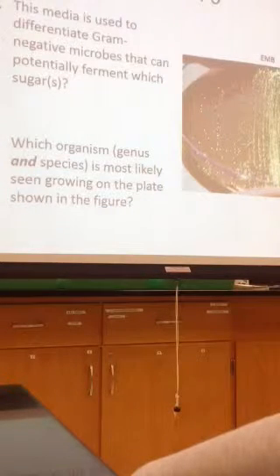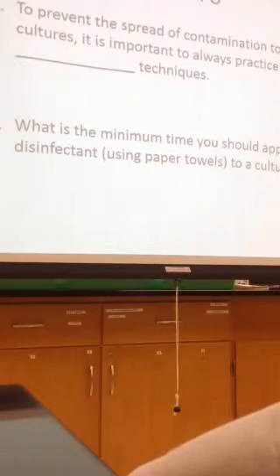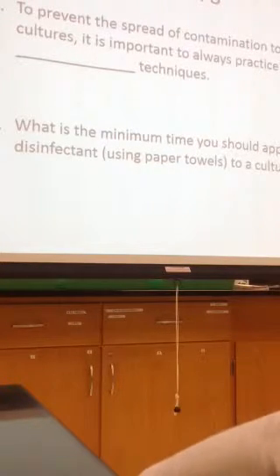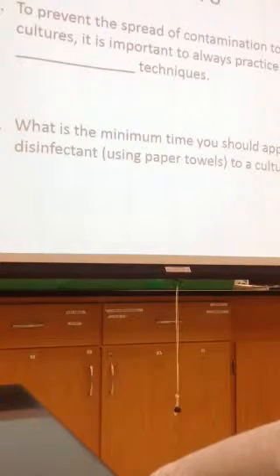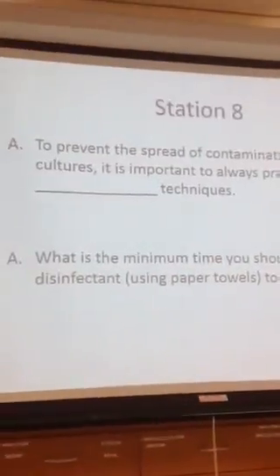You guys don't have to worry about E and B. We haven't got there yet. Or this one. Okay, to prevent the spread of contamination, what kind of techniques do you use? Aseptic. Fine. Okay. What's the minimum of time you ought to apply disinfectant using paper towels to every spill that you make?